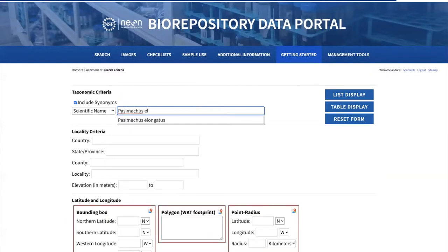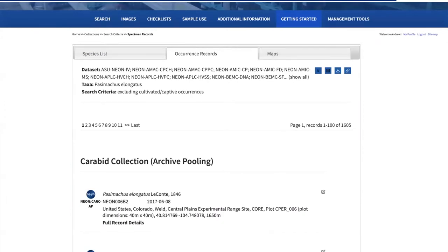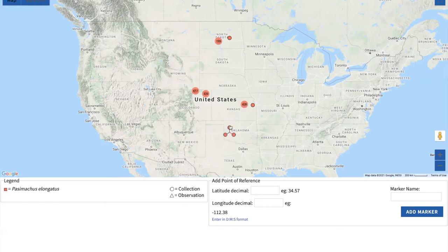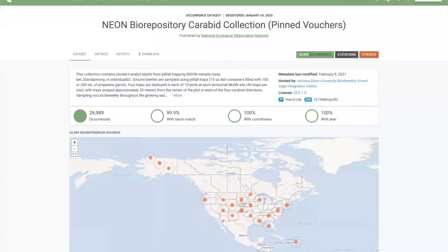Anybody can go on to our portal and search for, say, Passimachus elongatus. We can search all records and see that we have 1,600 samples of Passimachus elongatus. We can also open this up in a map and see records from a number of NEON sites from North Dakota down to Oklahoma — some sites have hundreds of specimens, some have as few as three. Individually, we can check these records and see the species, domain, date collected, and locality. All of these data are searchable in our portal, and we publish them out to GBIF, where all the data are integrated. You can see almost 27,000 pinned carabid records from the United States that have already generated four citations.